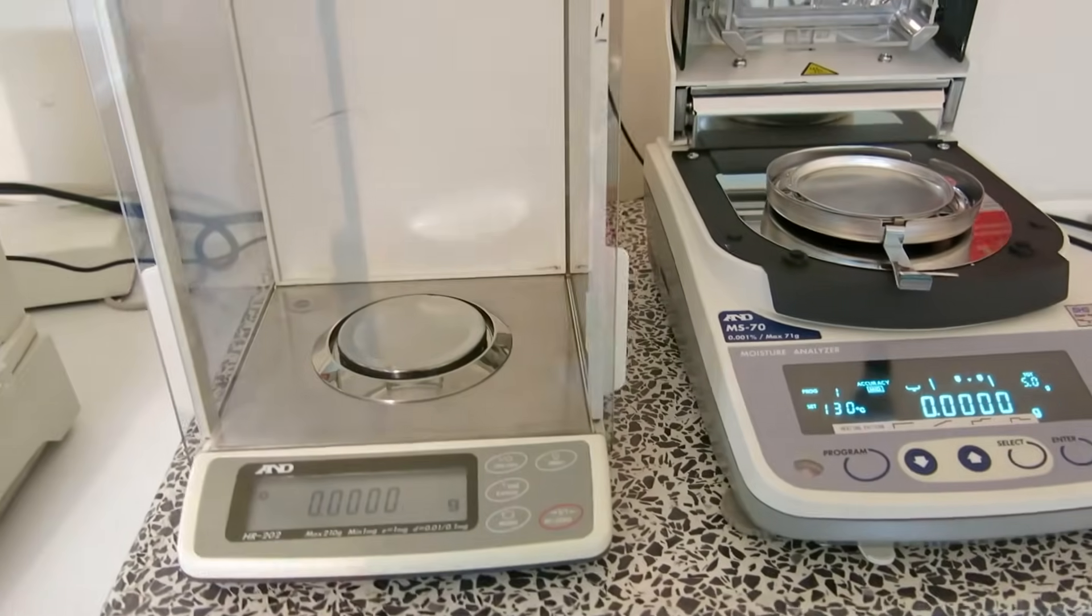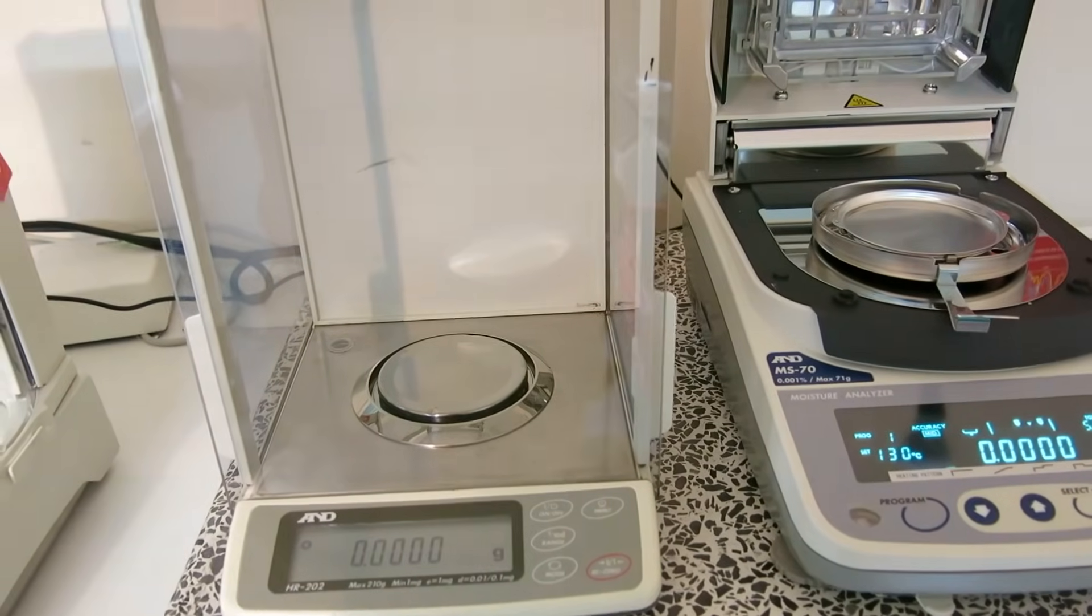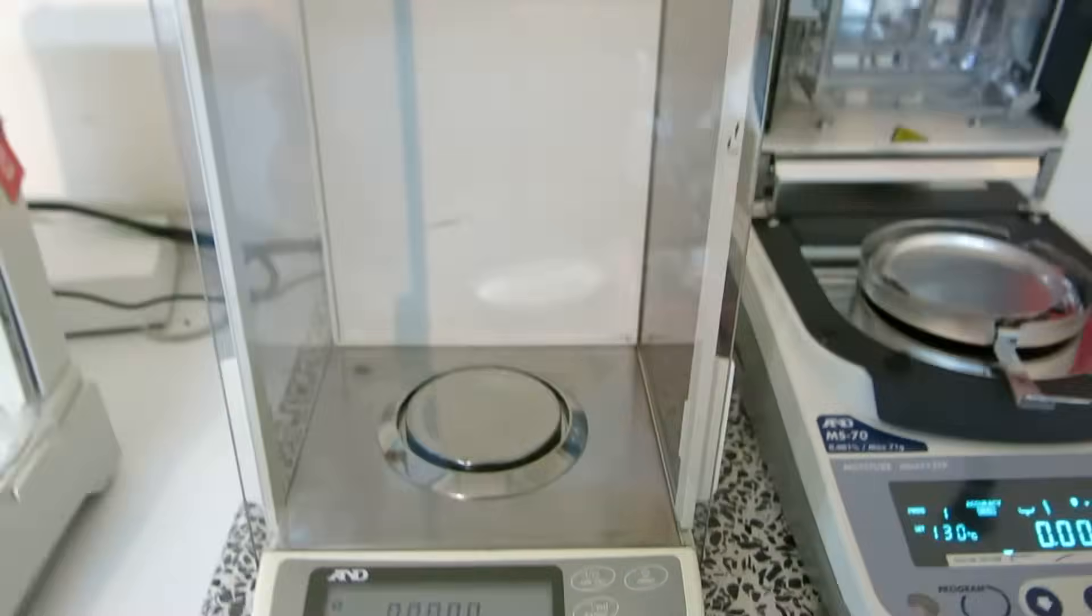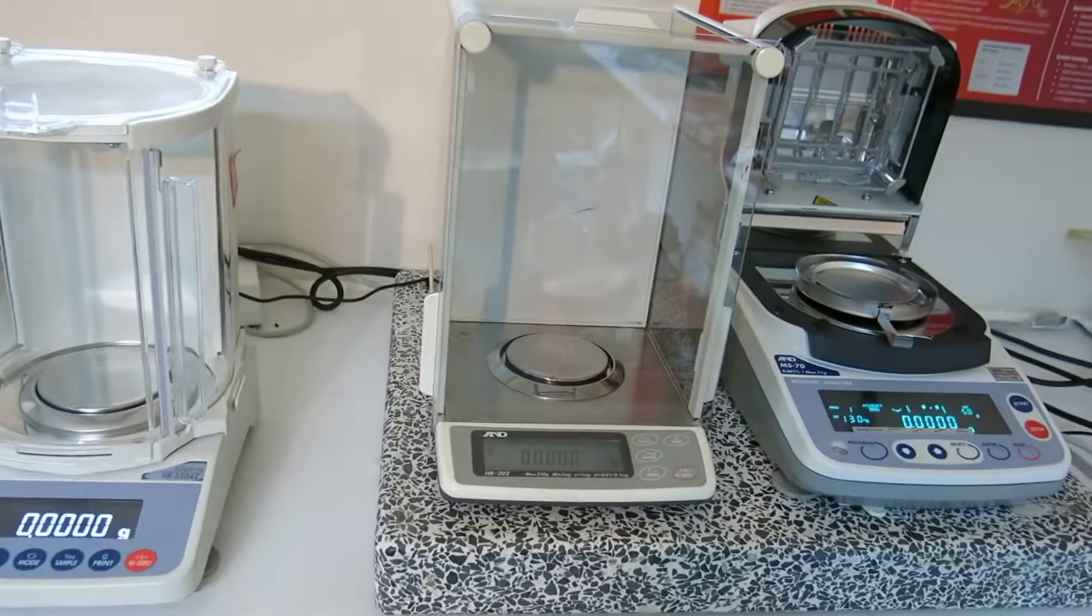Moving on. We've got the A&D HR202. This is a used balance. This is a 5 decimal place. 210g. Again, excellent balance. Very good condition. Talk to us about that.